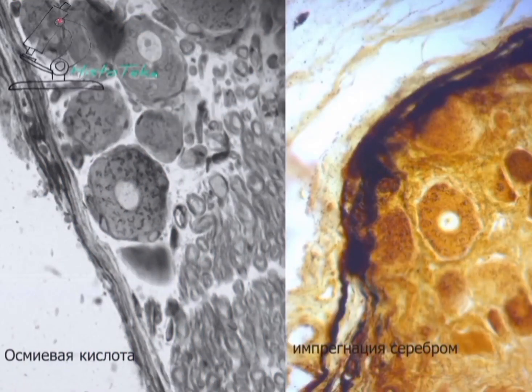The Golgi complex is a single membrane organelle represented by a system of dictyosomes. Each dictyosome is a stack of 10 to 15 flattened membrane cisterns. Let's consider two histological preparations of the same organ, the spinal ganglion. One of the preparations is stained with osmic acid and the other is impregnated with silver salts.